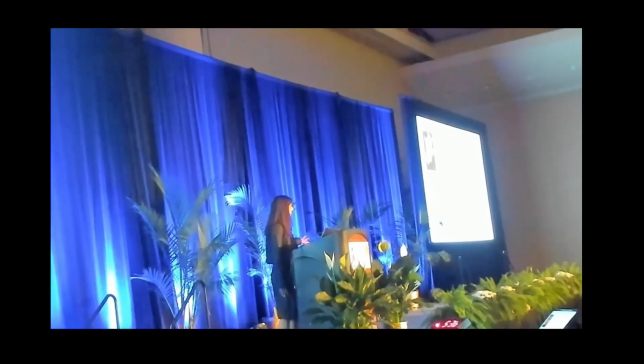You can't do it with this method, but if you use something like EELS spectrum imaging or possibly EDX mapping, you can do it. I have an example that I didn't have time to show here of EDX mapping 3D tomography. But it's harder and you need things to be stable because you need to take maps for longer at each tilt angle. You don't just take one image, you have to take a 5-minute map or something, whether it's EDX or EELS, to have enough signal. And then you need to accumulate all of those images to get the 3D image of it. But it is possible.